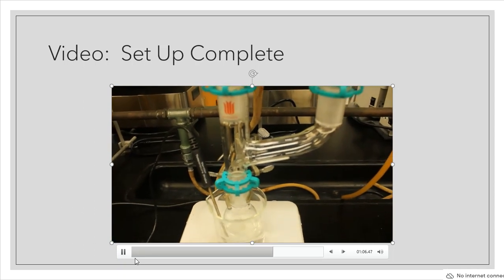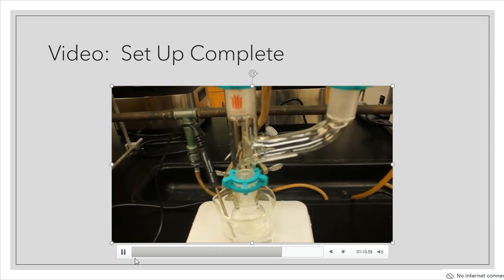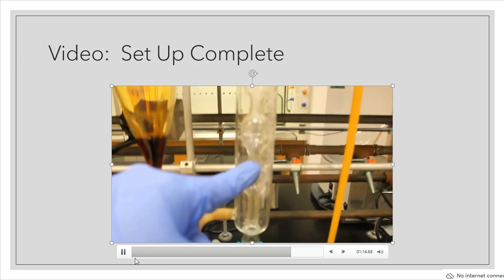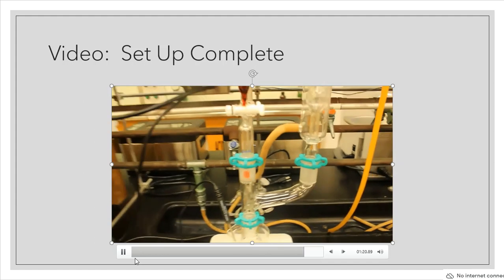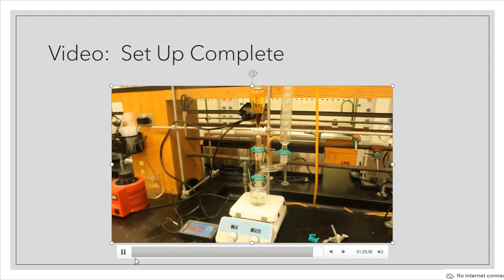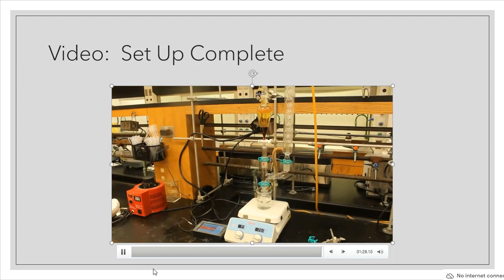So if I do get any vapor, if I do get any kind of gas that gets liberated from this reaction, it's going to go up the Claisen and it's going to go on this side, which is nothing more than a reflux condenser. So this is the setup of the trans-cinnamic acid addition, folks. There's all the pieces and parts that you need in order to get this thing to work.